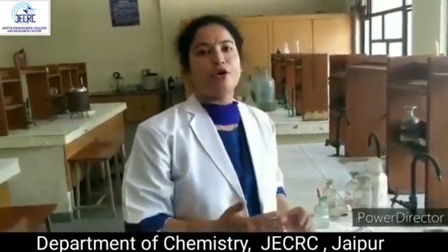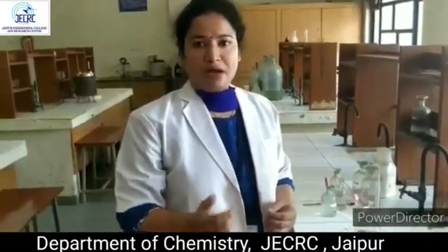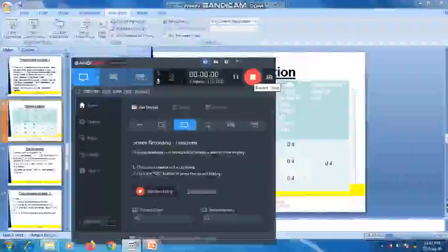We'll repeat this experiment till the concordant reading appears. The concordant reading is the consecutive reading, that is, the same reading appearing in the observation table. Through this reading we have to calculate the answer, that is the achieved outcome: how much dissolved oxygen is present in the water sample.